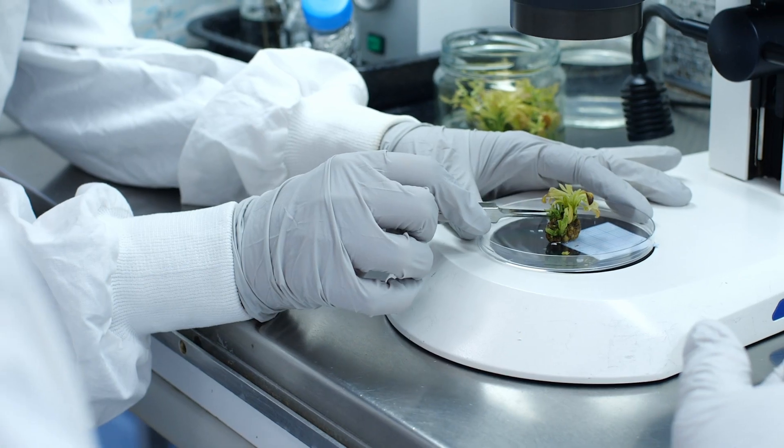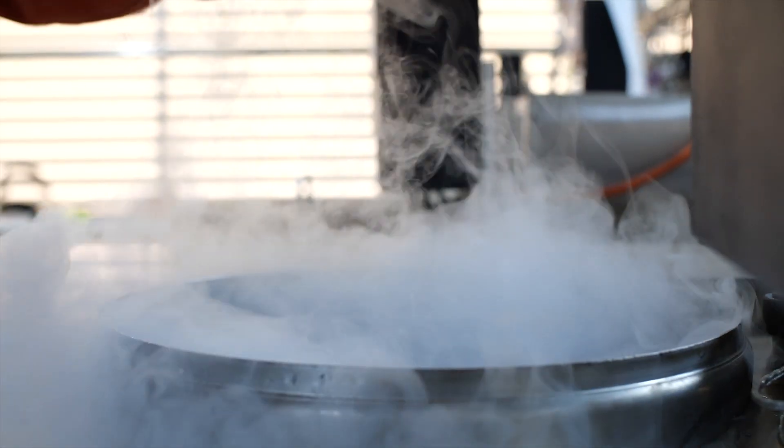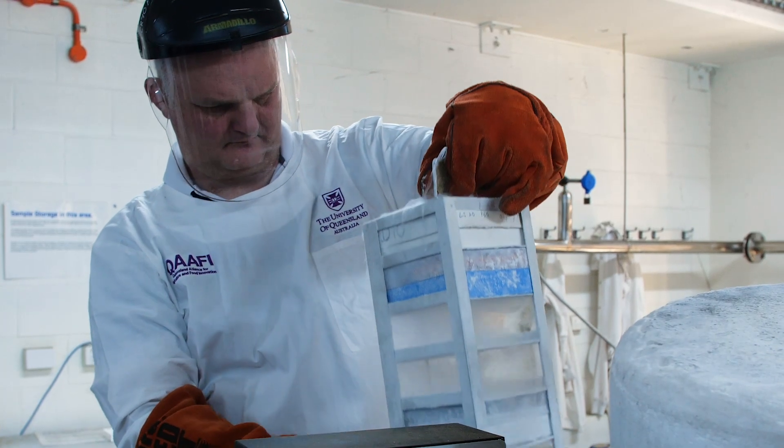This is a major breakthrough and it's the first time it's been done in the world. What we are doing is taking a small, tiny cutting from an avocado tree, plunging it into liquid nitrogen at minus 196 degrees centigrade, but then reviving the entire plant after taking it out.